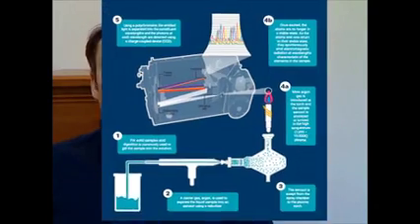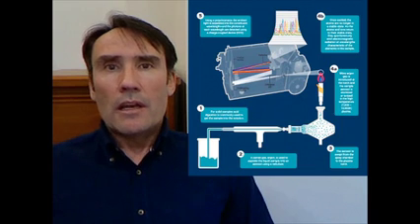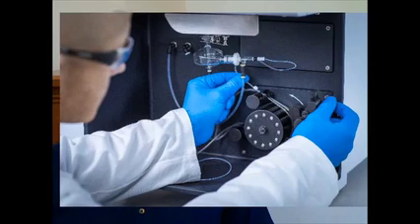There are a number of components that make up an ICP-OES, and I want to follow the sample path through this instrument to talk about each of those components. I'll finish off this short presentation by looking at a few different application types that can be applied to the ICP-OES. So, introducing the sample.